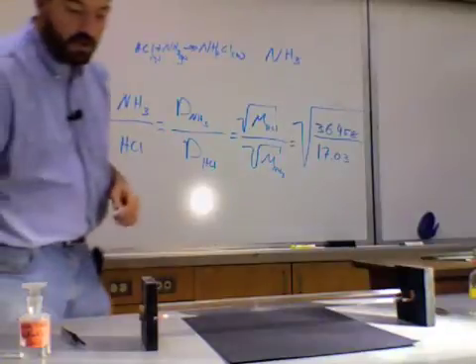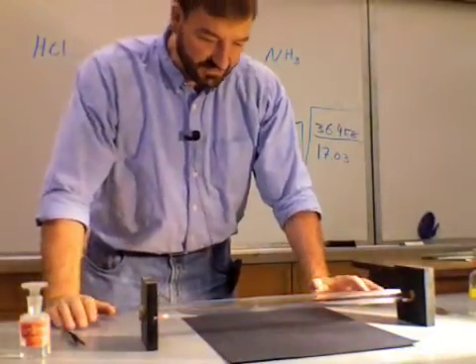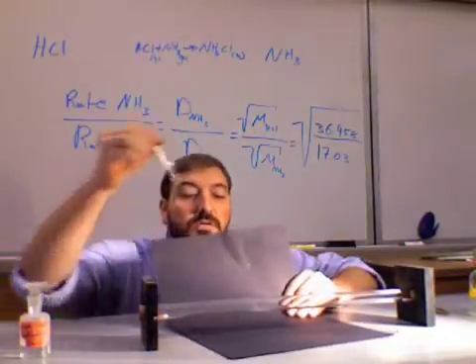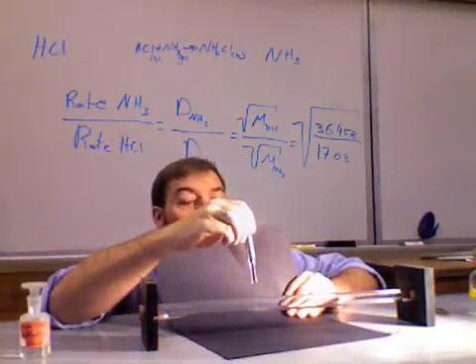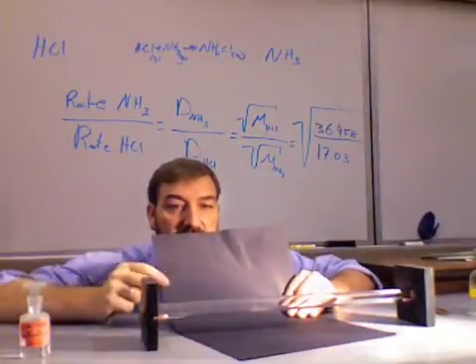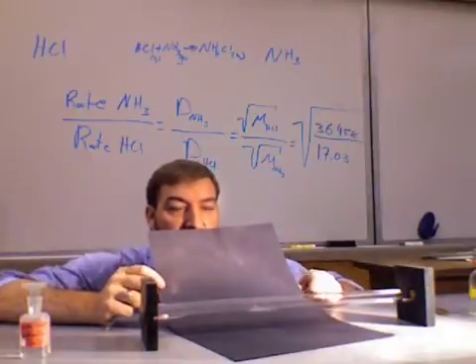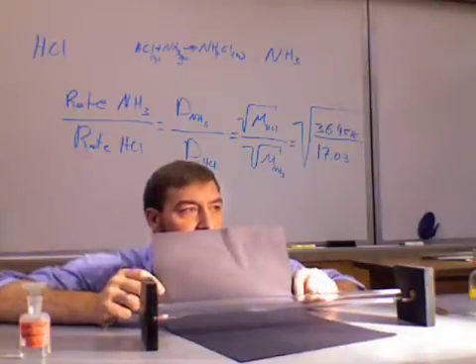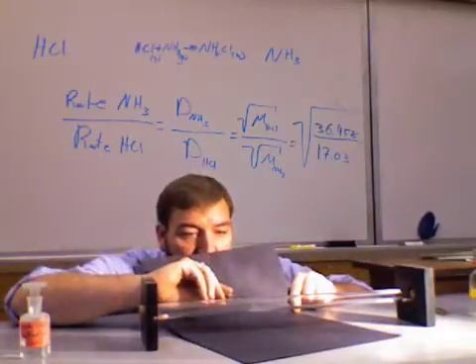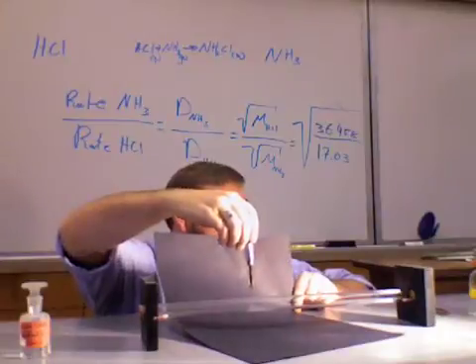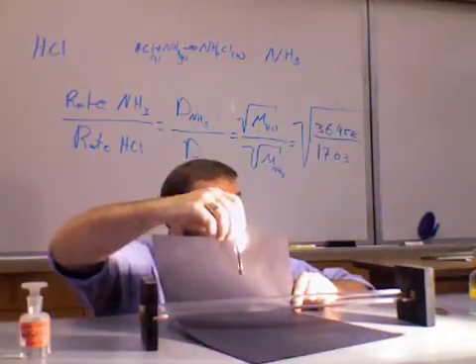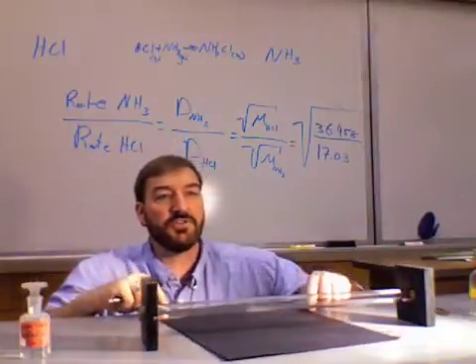All right. So... You may or may not be able to see this at this point. It will start to get a little darker. But if you look right about here, you can start to see a smoke forming inside of the ring. You can start to see that smoke forming inside. That smoke, that white smoke, and you can see it sort of forms a line. That's where the ammonia and the hydrochloric acid met. That's where the two gases came into contact. Which side is it closer to?